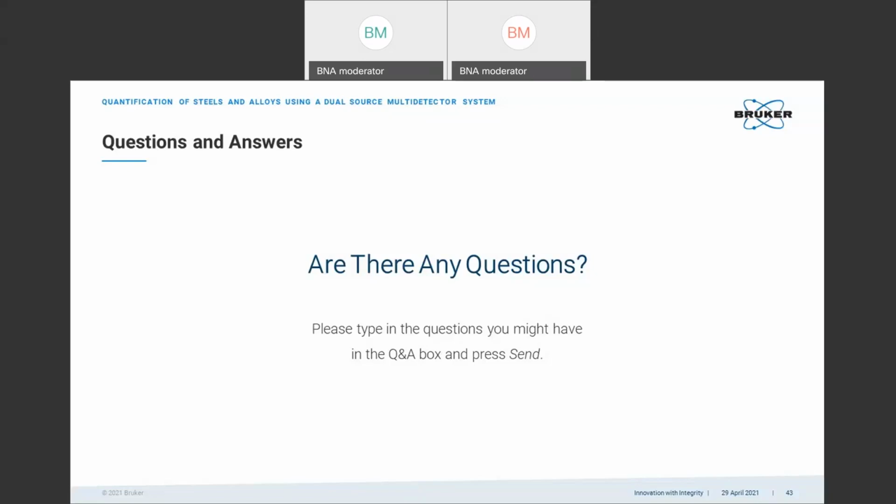And therefore, if there are certain elements, say the higher energy elements that could be done by WDS, you may end up taking a long time analyzing them individually. So if you have access to the combined system, you can prioritize your most important elements and be conscious of the total analytical time required. Yeah, definitely. That's a good point.